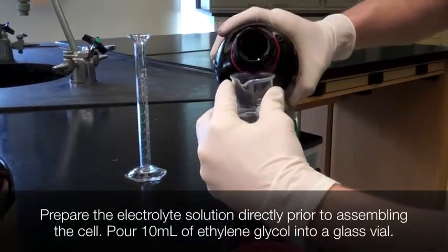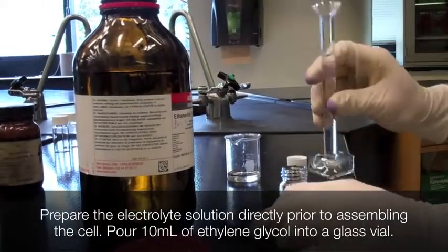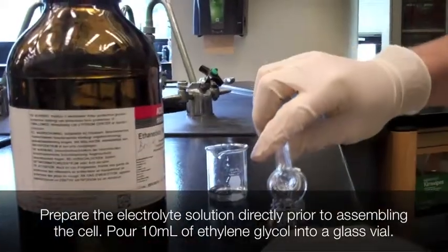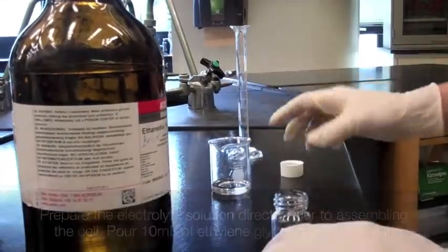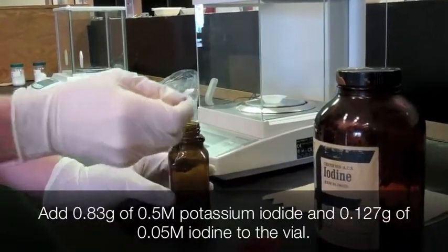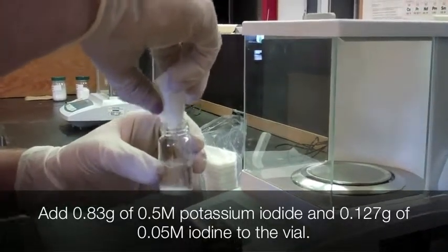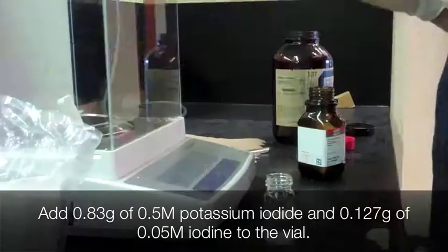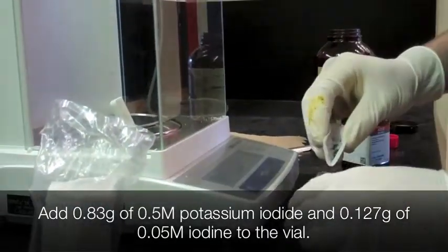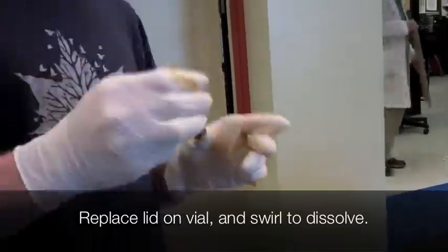To prepare 10 milliliters of an electrolyte solution, pour 10 milliliters of ethylene glycol into a glass vial, avoiding exposure to water. This solution should be made fresh right before assembling the cell. Add 0.83 grams of potassium iodide and 0.127 grams of iodine. Replace the lid on the vial to minimize exposure to air and swirl until everything is dissolved.